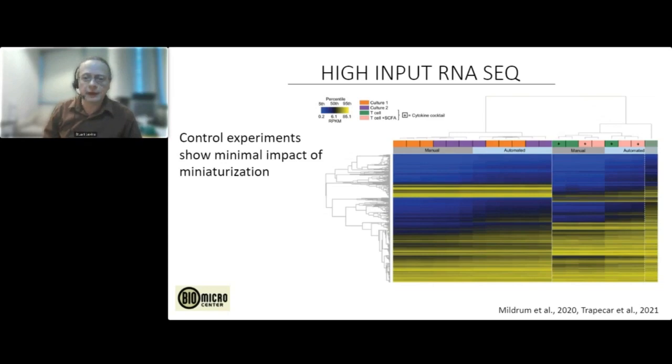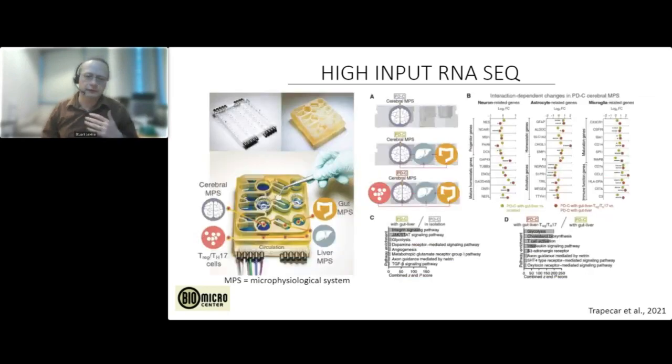Okay. And we've used this for many, many different experiments. This is an example from the Griffith lab, doing high throughput experiments with organs on chips, where we're able to isolate the RNA from a whole bunch of different areas, samples, and process them all in batch.